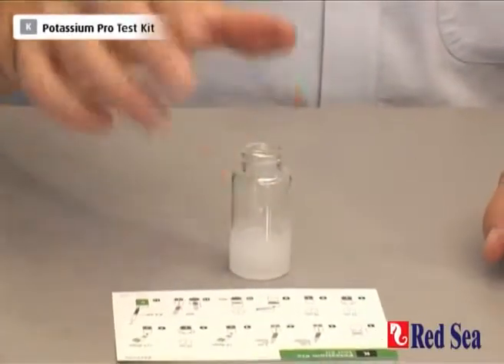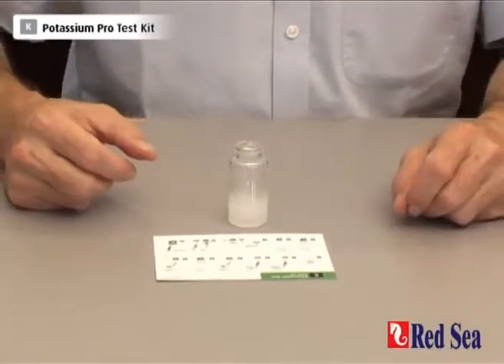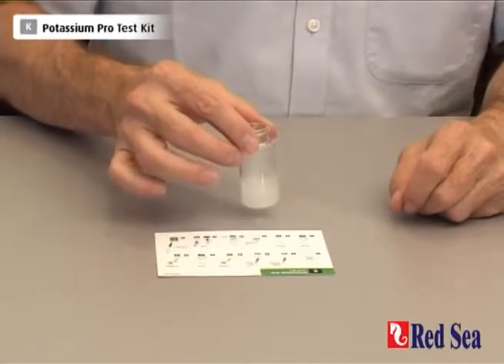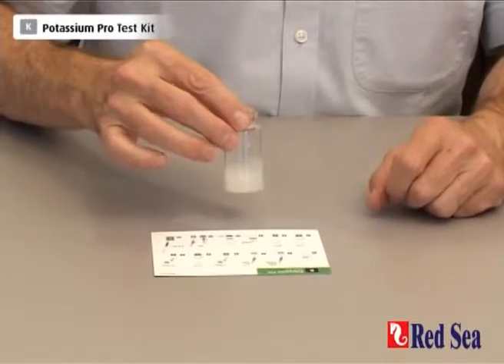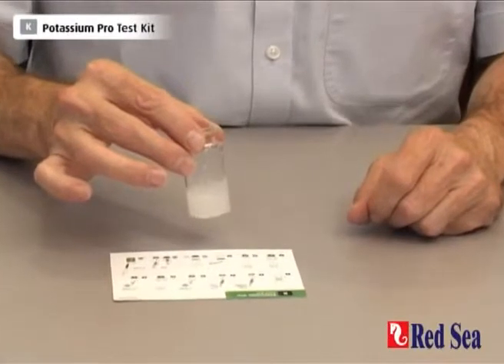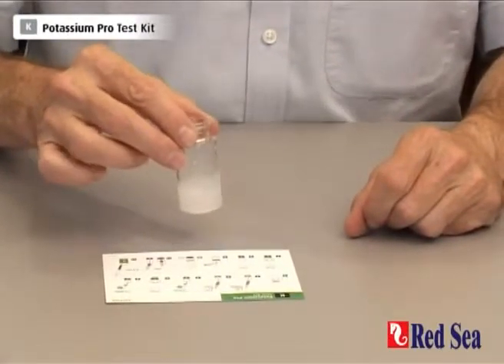Now we have to let that settle for about 10 minutes for the reaction to take place. This is normally the end of most potassium test kits because they are based on turbidity. But this system filters out the turbidity after the reaction and then we're going to do a titration. So the first thing we have to do is prepare our filter.